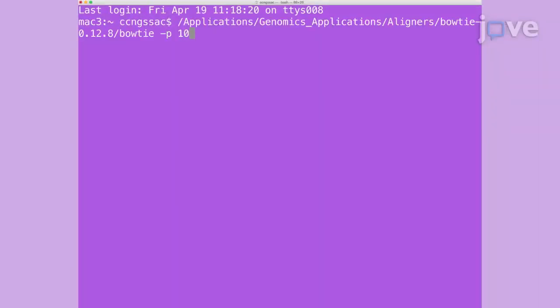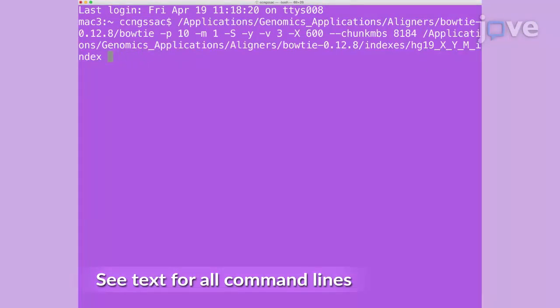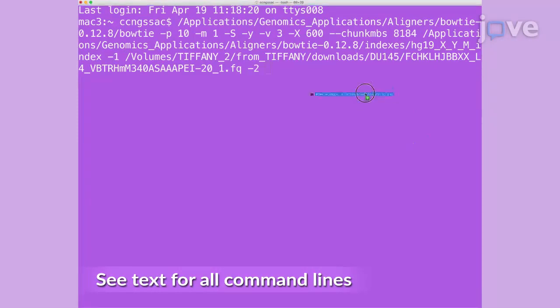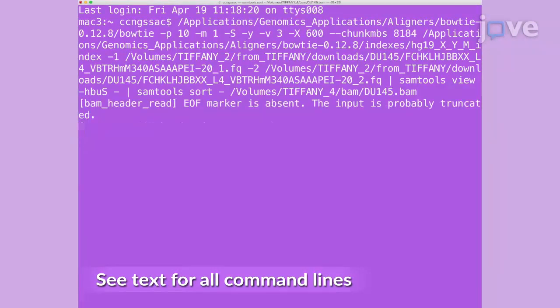Run alignment of paired-end sequencing FASTQ files with the RNA-seq sample of interest using bowtie1 by typing the command line in the Linux terminal. This alignment strategy requires that transcripts be uniquely and collinearly aligned with an exhaustive genomic search. The strategy provides confidence in the calling of reads mapping specifically to a single L1 locus.